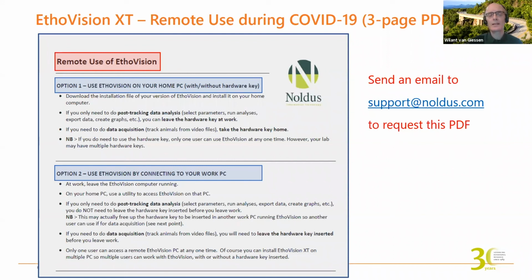But yeah, we always suggest that people make backup files in the older version, the original version, and keep those safe. And then you can completely open up experiments in the new version. It automatically becomes an experiment in that new version. The reason for making those backup files earlier is that you cannot now open up the newer experiment back in the older version. So it's not backward compatible in that sense. So you have to keep your workflow pretty clear so you don't get into trouble.